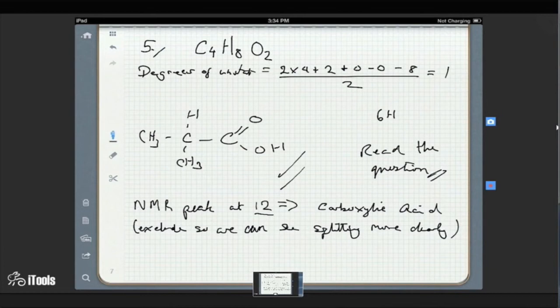You guys were hoping that the 1H in the picture was the carboxylic acid group. So that 1H is not broad. That's not what a broad peak really looks like. For one thing, broad peaks are not usually split like that. Let's look at the splitting here. What's the splitting on the 6H? It's a doublet. And does that match your picture? Yes. Yeah. It does. That's a good thing to confirm because they're next to a carbon with one hydrogen.